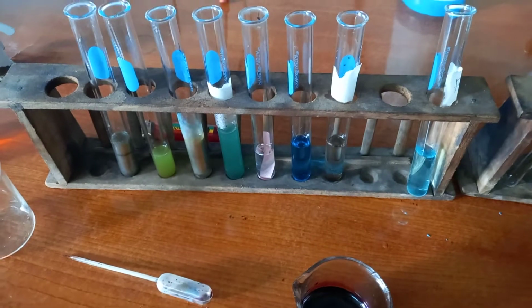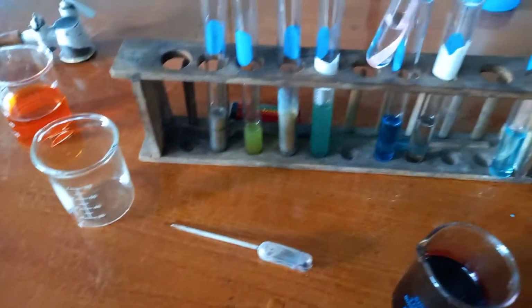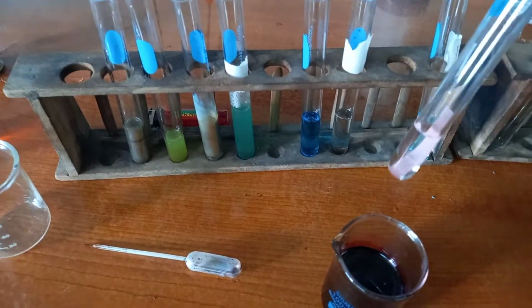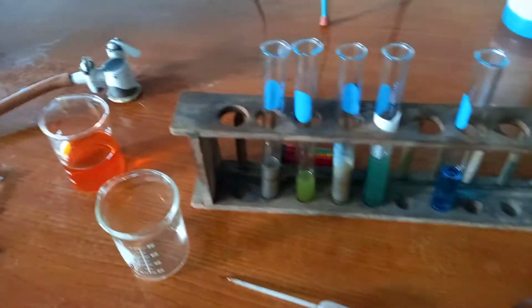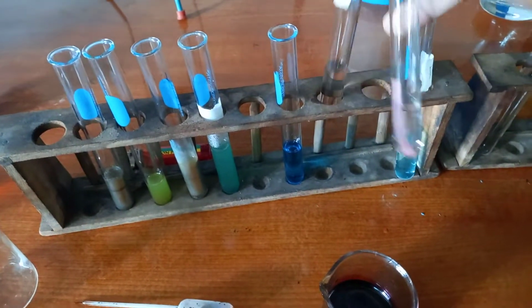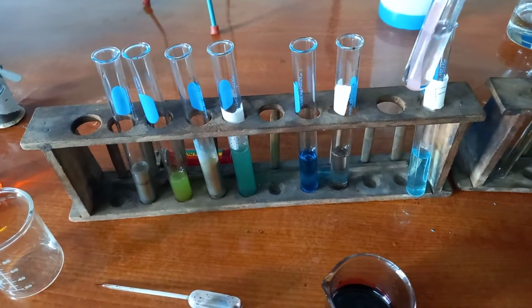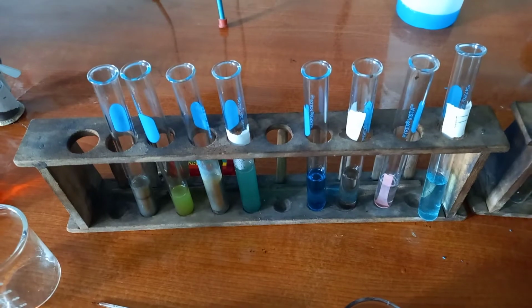So we're just picking up with the same reactions of the aldehyde. We had oxidized our aldehyde that we had produced with potassium permanganate. These two test tubes were the aldehyde that we have oxidized. I was testing it to see if they were converted to carboxylic acid, and the first thing I did was to place a blue litmus paper in it. So I'm going to do it and let you see it as well.